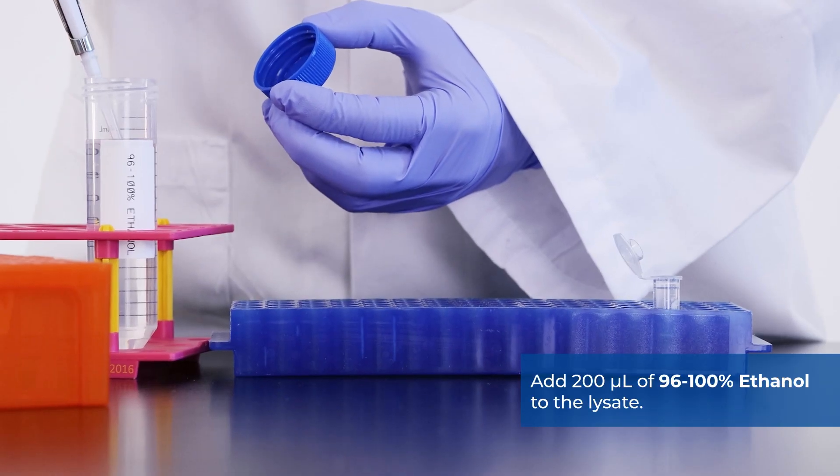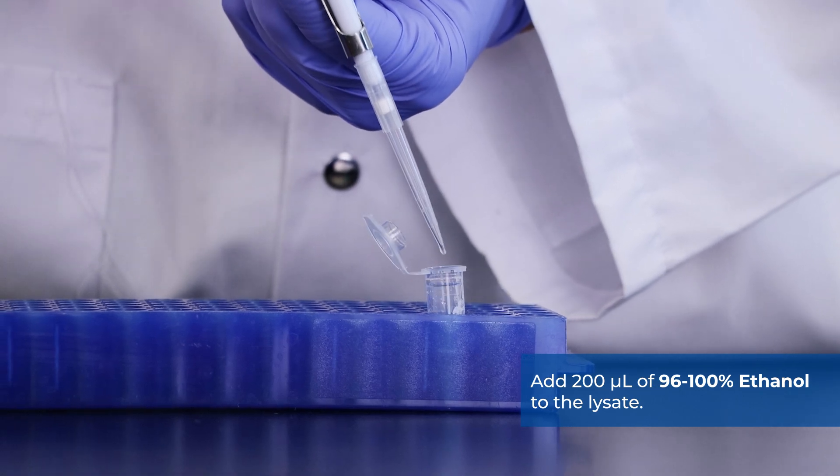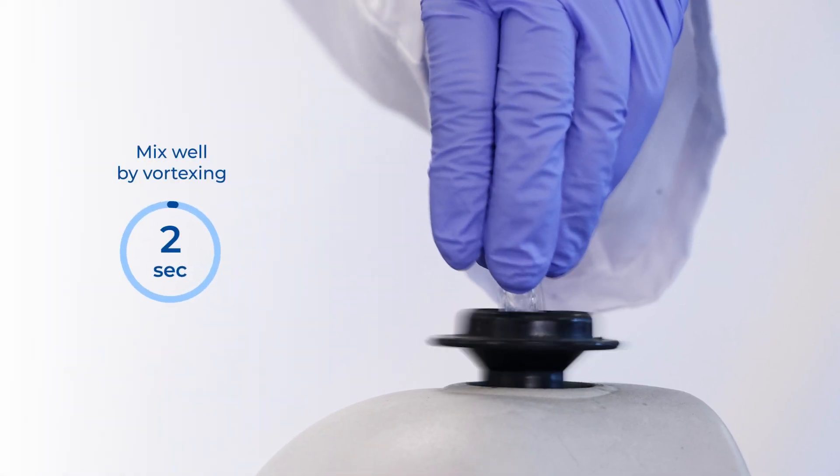Add 200 microliters of 96-100% ethanol to the lysate. Mix by vortexing for 10 seconds.